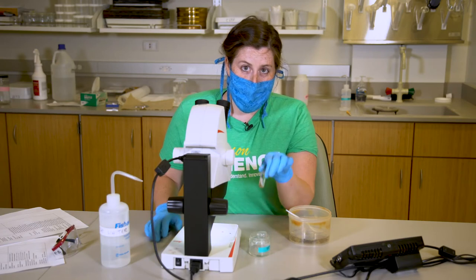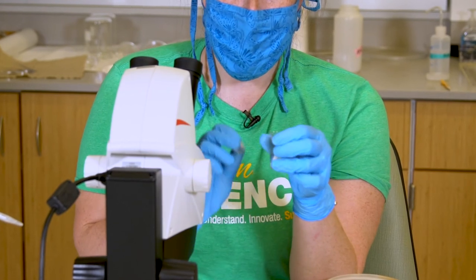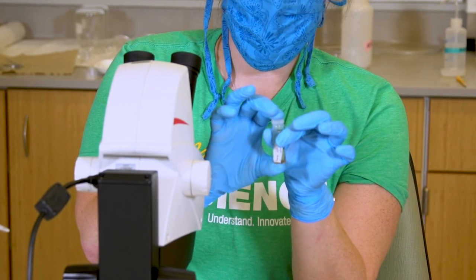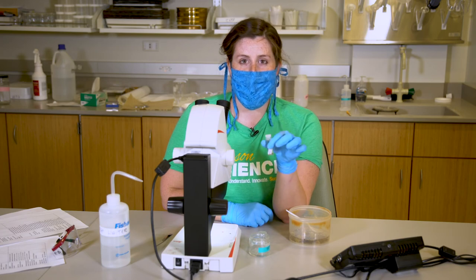After you are done sorting your sample, this will be your final product. You're going to cap your vial full of your fish eggs and larvae and deliver it to George Mason University for identifying the individual fish.